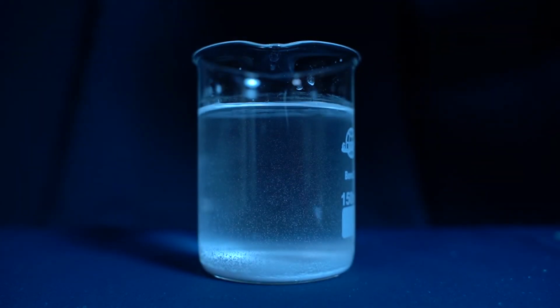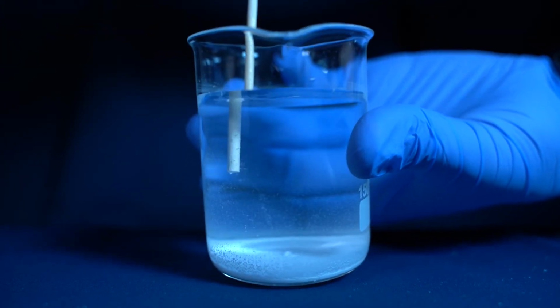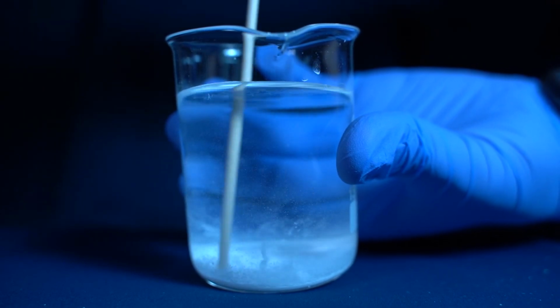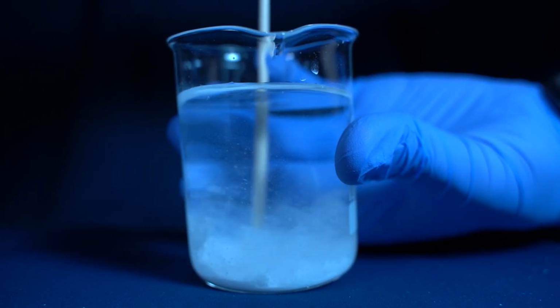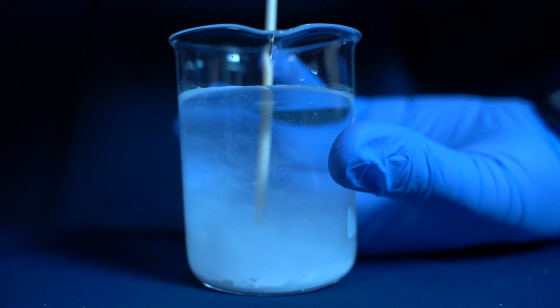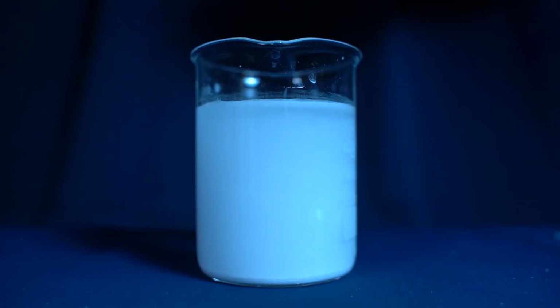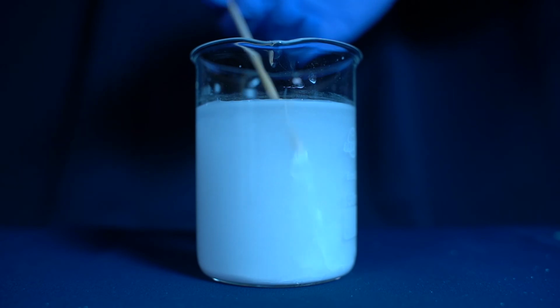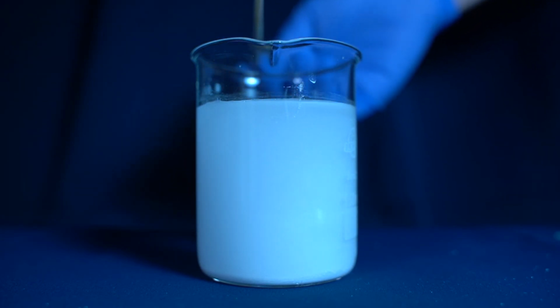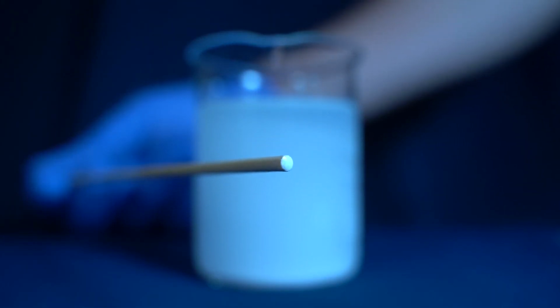And if I take this stick and poke it a little bit, you'll notice that as I stir the precipitate, it becomes suspended in the water. Suspended just means that it just floats in the water without really being dissolved. It may not look like it, but it is solid. And there's even some solid precipitate at the end of this stick. That's the white stuff.